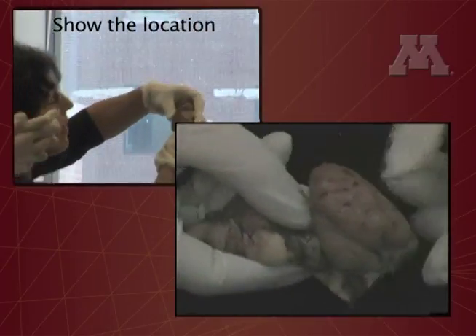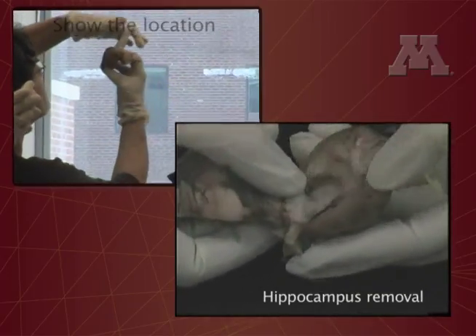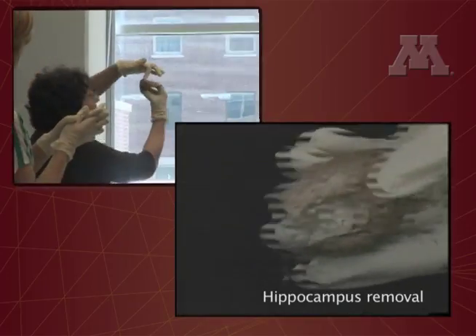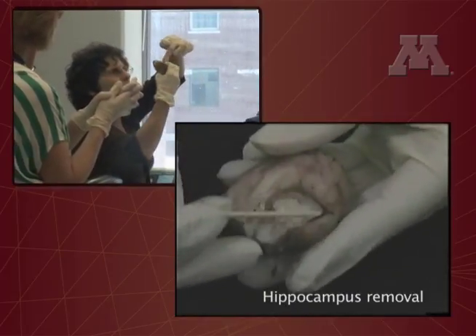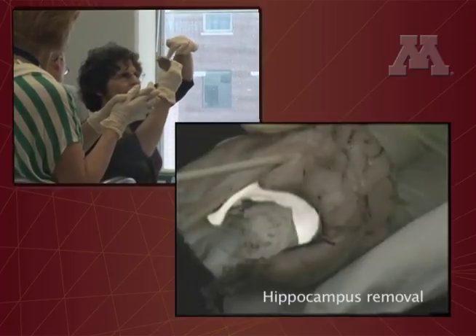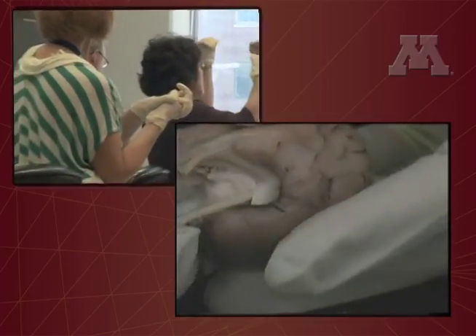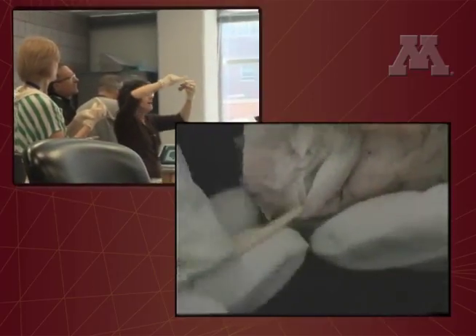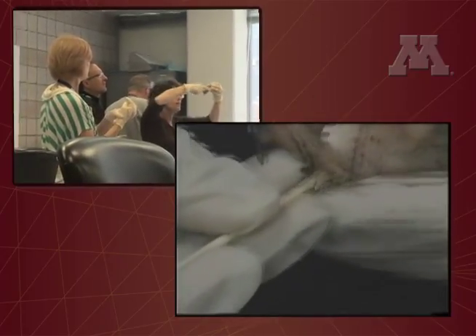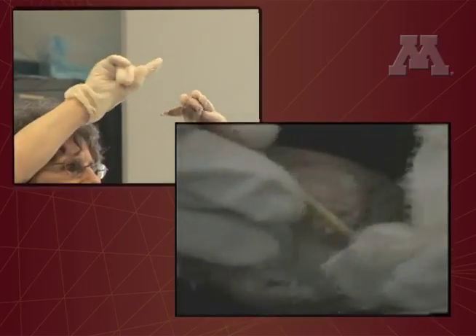Following up your brain stem into underneath the temporal lobe — pull slightly forward that whole midbrain piece and you look up into what becomes the lateral ventricle in that temporal lobe. You see a curved structure right in the heart of that temporal lobe that kind of curves like a C. It's curving like a C because it's part of the bends and folds of the neural axis during development, and that is the hippocampus. When I move the brain stem out of the way and look up into there, I can see the hippocampus.